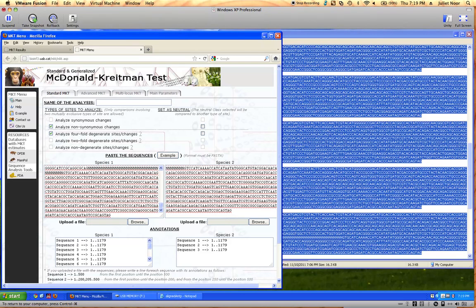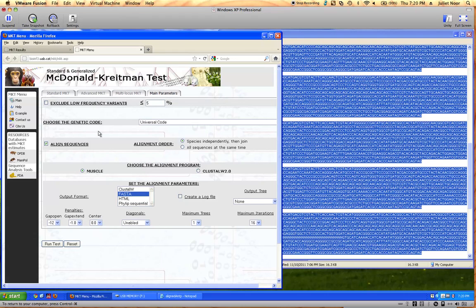Four-fold degenerate means codons where the third position can be any nucleotide and still code for the same amino acid — so no matter what mutation happens at that third position, the amino acid won't change. We set that as neutral. The boxes checked now are 'Analyze non-synonymous changes' and 'Analyze four-fold degenerate sites/changes' with a checkmark to set that as neutral. We still need to go to Parameters and say don't align the sequences, then run the test.